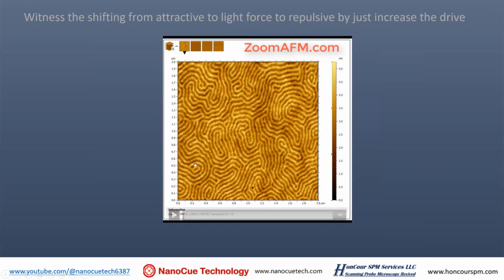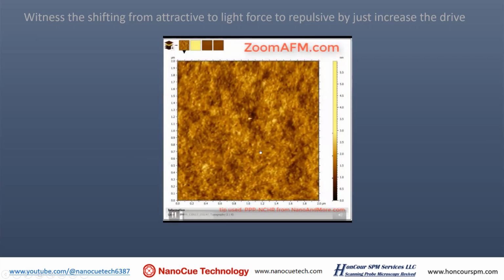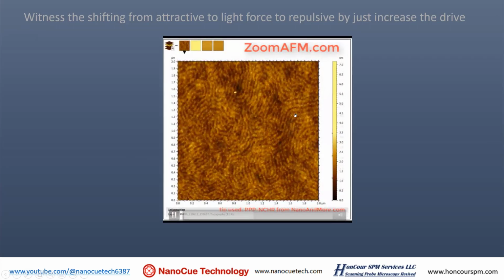And that's because Atomic Force Microscope imaging does not look at your sample. It actually pushes on the sample and touches it. It depends on how hard you touch. If you have a light touch or a harder touch, the sample will behave differently. It's like you lay out some golf balls on a mattress and then you put a blanket over it. You use a small force, you can sense the fibers of the blanket.